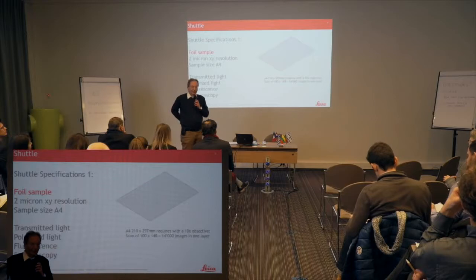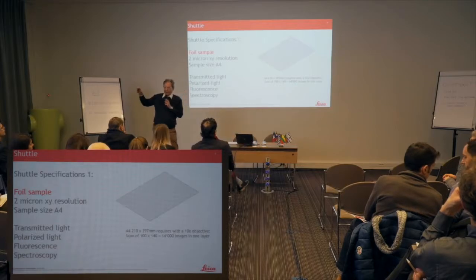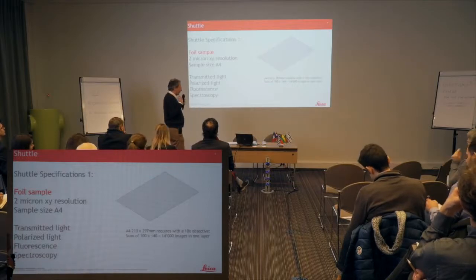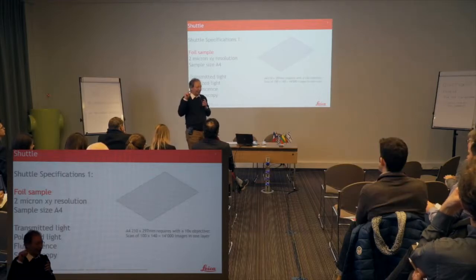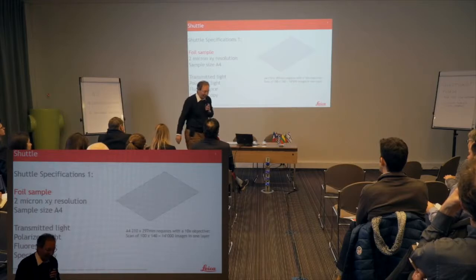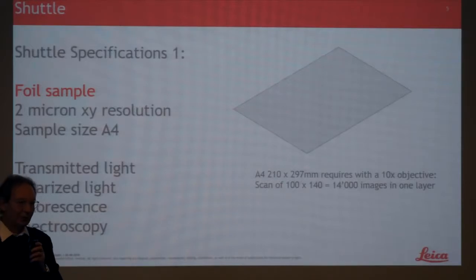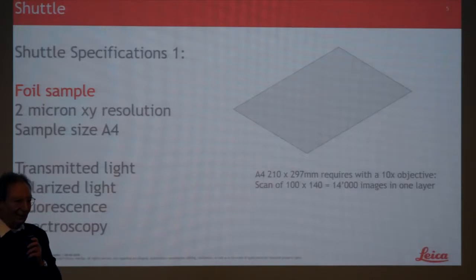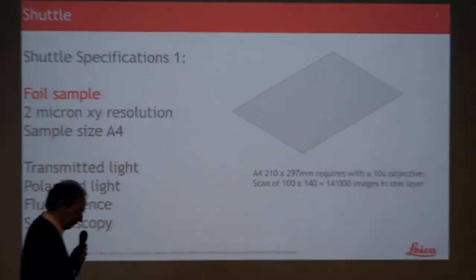The size of these images, of course, then depends on what resolution the camera has, so in how many pixels we take that, if we take it with 8-bit or 16-bit depth of color. So there is a lot of implication in terms of file size also. And just actually thicker, up to I don't know what. Then you require also Z-stacking, which then multiplies the 14,000 times the layers of Z-stacking. And that will create very, very huge files. So to handle these files will be also beyond what we can handle with our software.